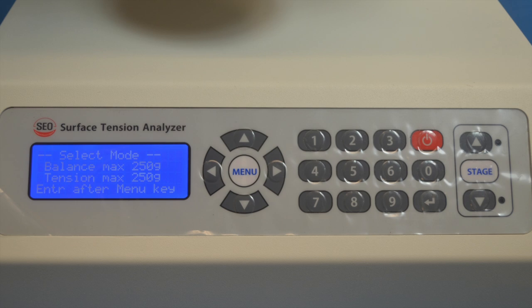The menu navigation is quite simple, and the display steps and instructions are intuitive. It's quite easy to set up.